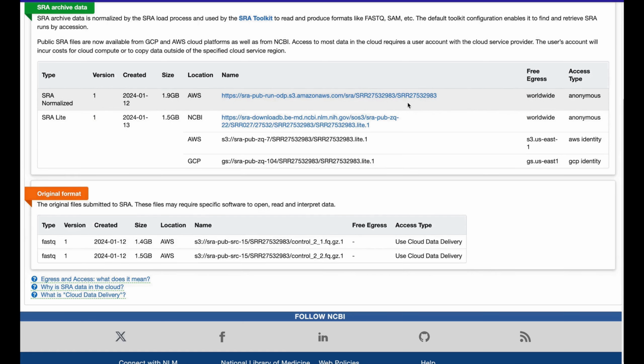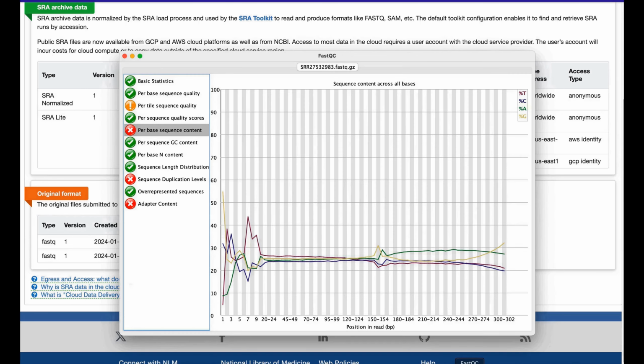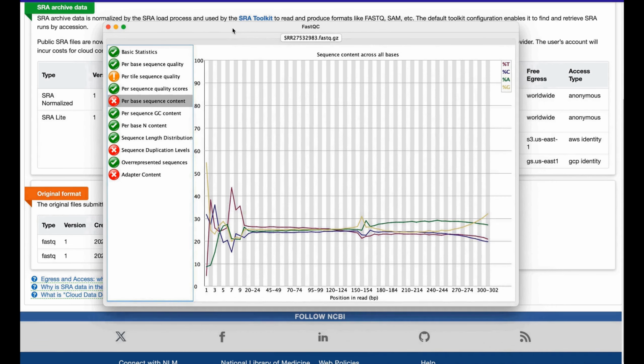And that's why it is bigger in size and bigger in length. The original length was 150. Okay, this mystery seems to be solved, why it is so suddenly in the middle. And the second run of paired end is usually worse by quality, so it is expected.